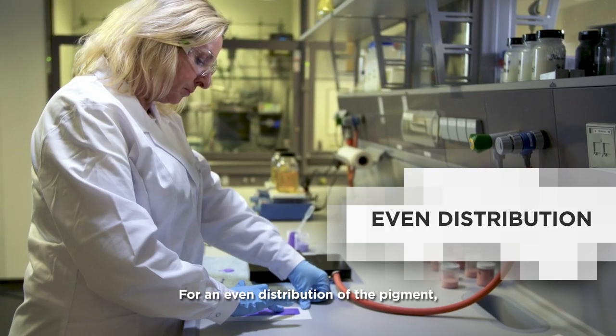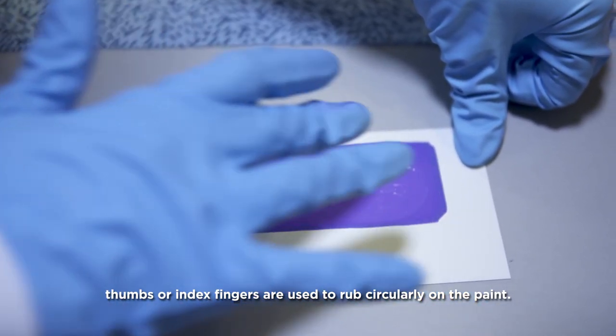For an even distribution of the pigment, thumbs or index fingers are used to rub circularly on the paint.